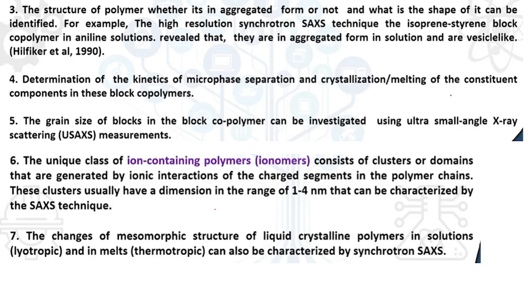The changes of mesomorphic structure of liquid crystalline polymer in solution can be characterized. So SAXS is possible for powdery material, for solution material, or semi-liquid or viscous type of material. You can check the SAXS.